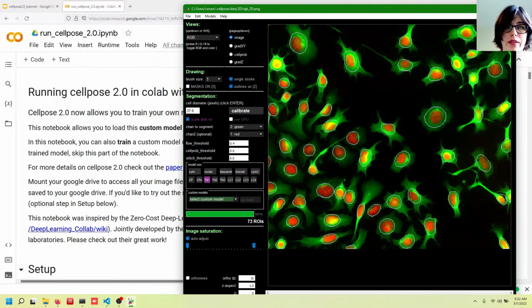Once you've run the training here, you might want to run your model on many images, maybe using a GPU, where you will want to do it on Google Colab. Or if you don't have a local GPU, you might have to do all the manual annotations locally and then upload them to Google Colab to make them run faster. Or, if you have a decent CPU, you can wait 5 to 10 minutes for the model to train rather than a minute.